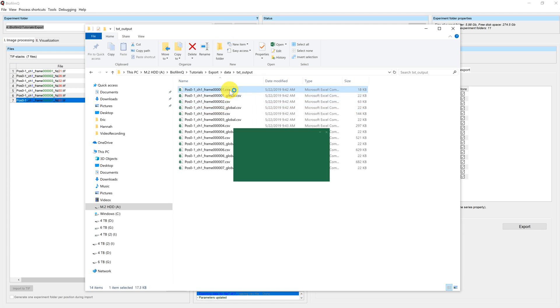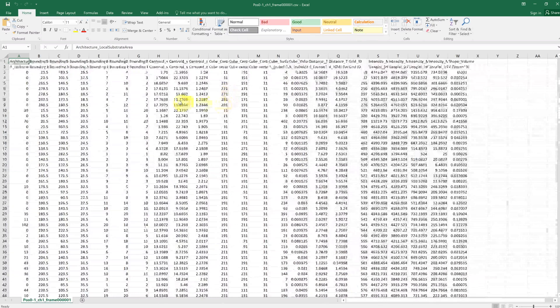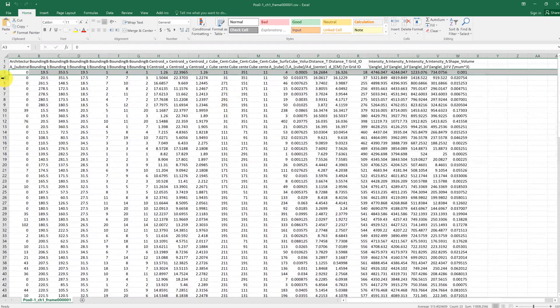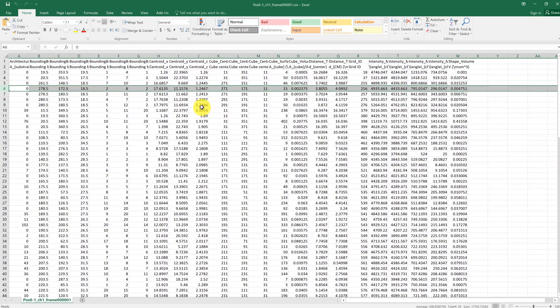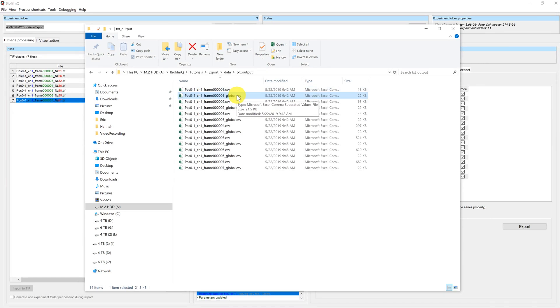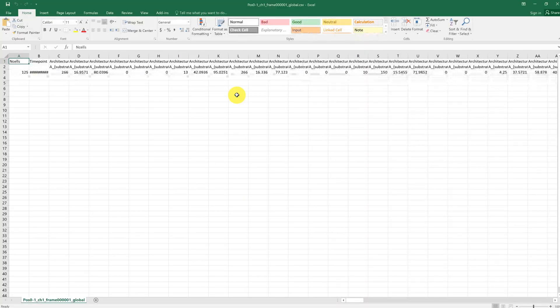In the file with the local parameters, you have a large spreadsheet where every single row corresponds to a cube in your segmented dataset. In the global dataset, you have a single line for every frame, since it calculates the global parameters for that frame.